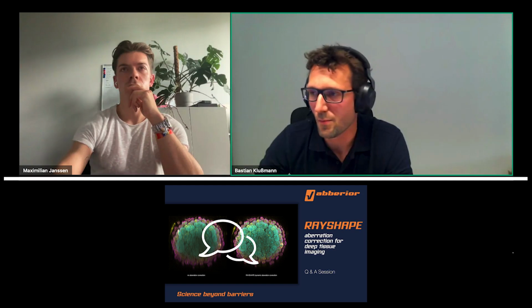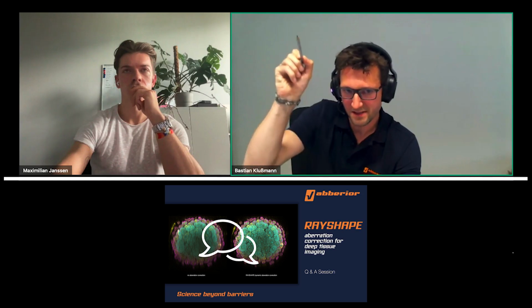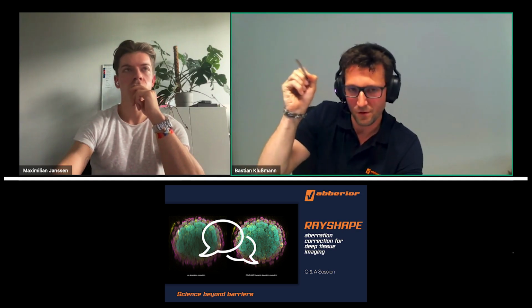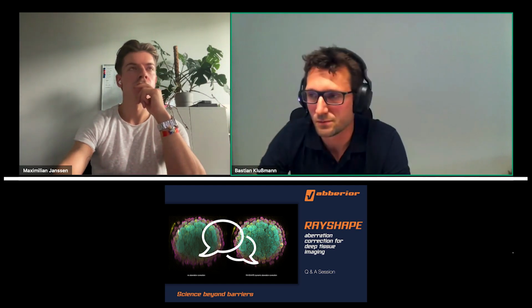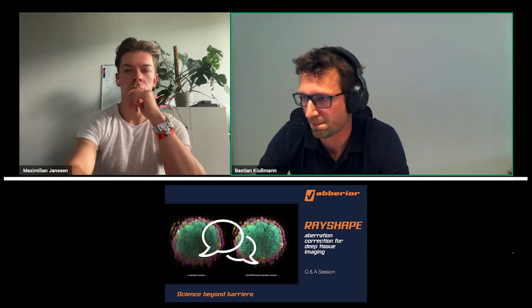I think, to answer this question, this is the beauty of using a deformable mirror. There are no compromises in terms of imaging speed. As I said, the deformable mirror is an electronic device, and it can change its shape very, very fast. For each individual Z position, even during an XZ scan, it can change its shape for each individual plane that is acquired. So it's really fast, you don't lose any imaging speed, and of course also no spatial resolution, normally.